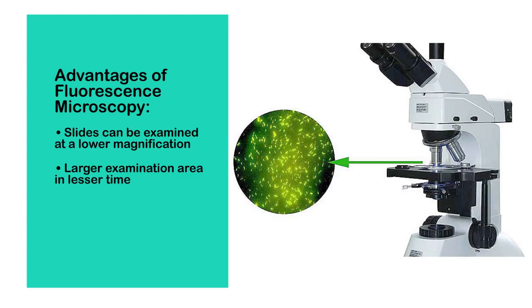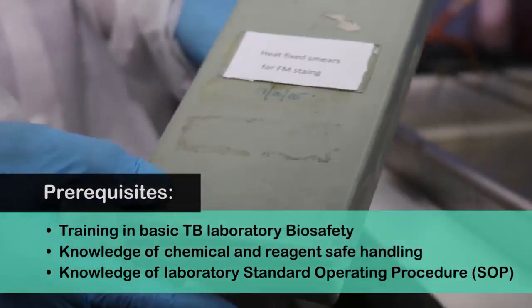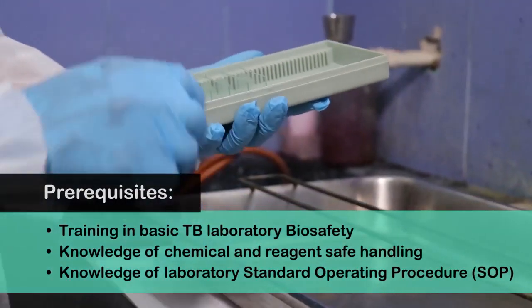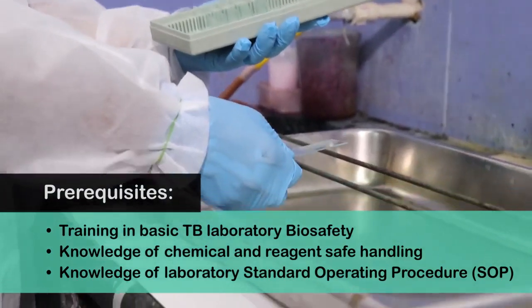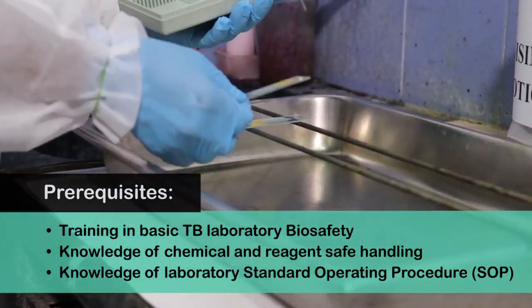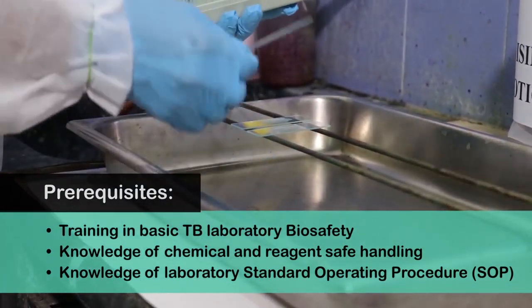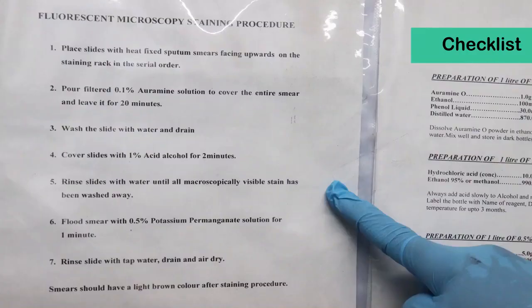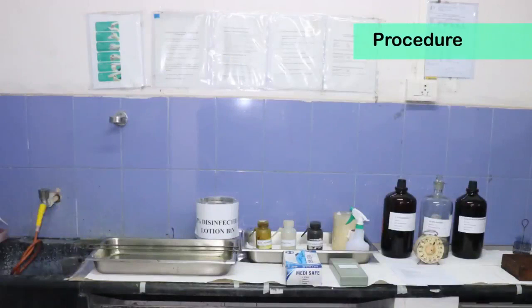Before proceeding, you must have training in basic TB lab biosafety, knowledge of chemical and reagent safe handling, and knowledge of lab standard operating procedure. Ensure to review the list of materials needed and always wear appropriate PPE. Now, let's begin the procedure.